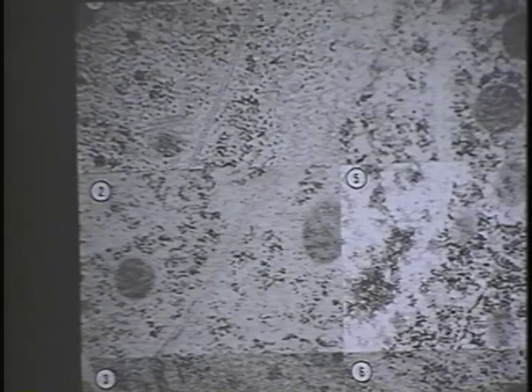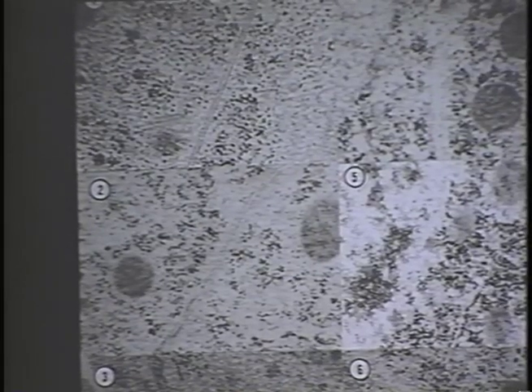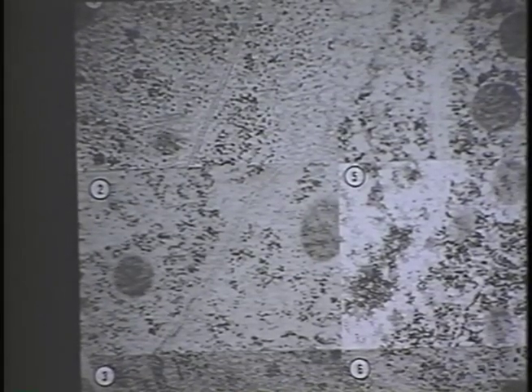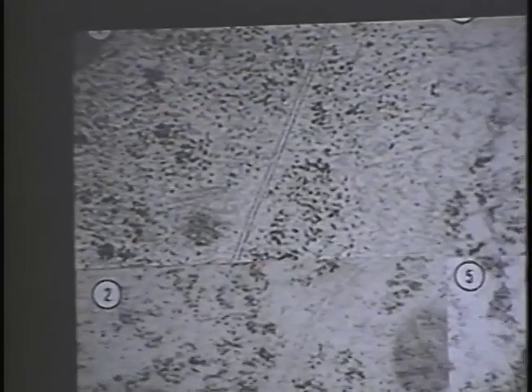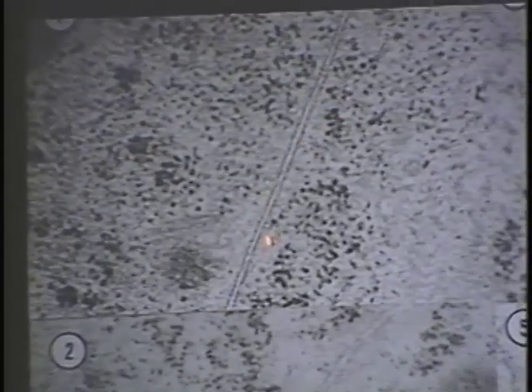They found that 1% osmium in acetone gave the best freeze substitution and resulted in tissue that had nice, dense, and uniform cytoplasm, a good definition and contrast of plasma membranes, as can be seen by the plasma membranes between these two adjacent cells, as well as the preservation of microtubules and organelles within the cell.